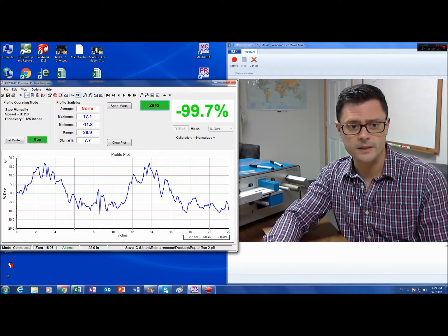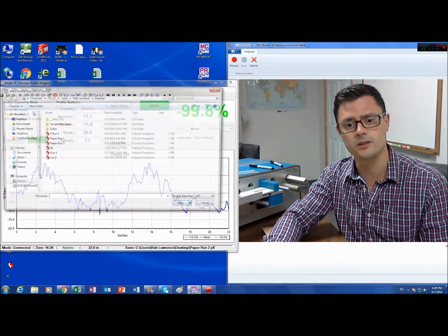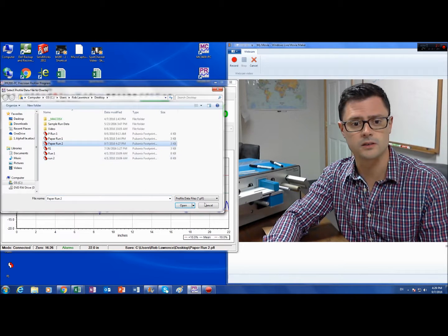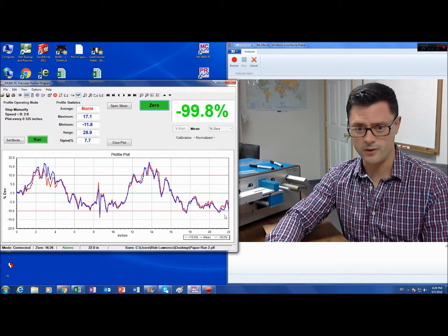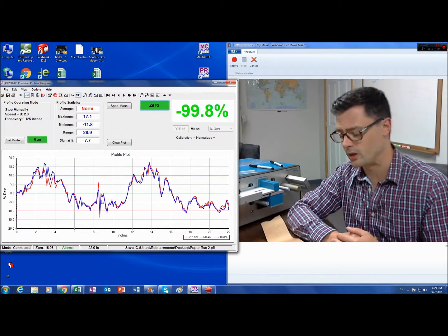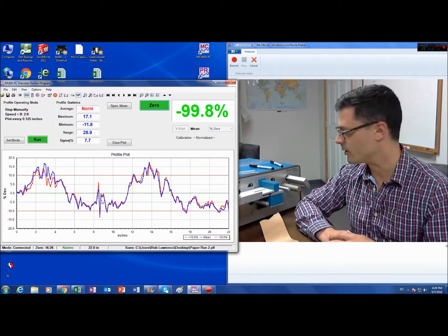Okay, so here's our graph. I just did a run. I'm going to open for overlay so we can see the repeatability of the run I just did. You can see that the runs match very closely. So with high precision and repeatability, we can measure the uniformity of this paper with our device.